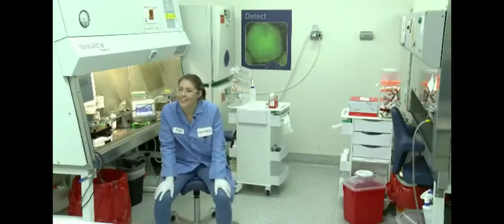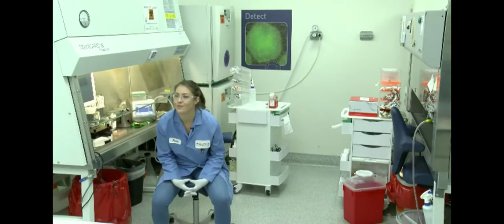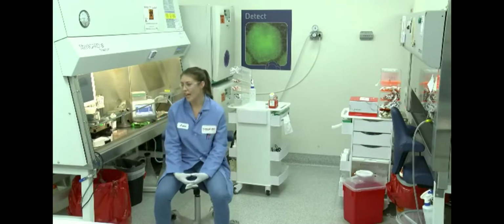All right, thank you, Jackie. Would you be able to address how the Neon system works with different cell types? Do you require individual buffer systems for the cell type that you use, or how does it work? Yes, so the Neon kit comes with a number of buffers. In this instance I use buffer R, and that's because I'm using iPSCs, but it also comes with a buffer T, which you can resuspend your cells in, but this is for blood-derived suspension cells only. So in most cell types you'll be using buffer R.